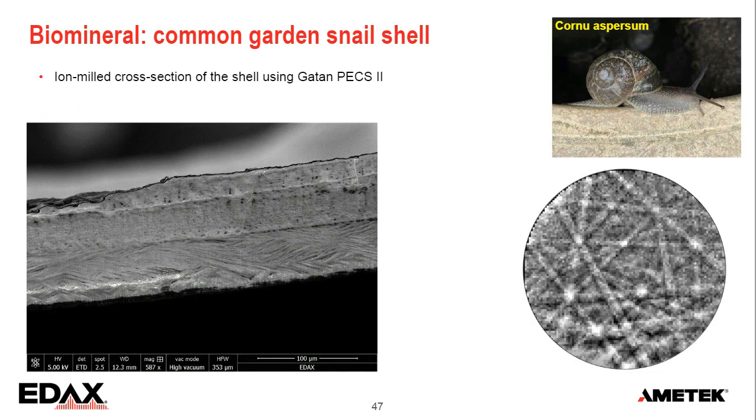That was just a little bit that broke out that I could glue onto a stub. For the ion milling, I mounted a small fractured bit vertically on a blade for the PEX and just shot through. So there was no mechanical interaction or force applied to these materials.